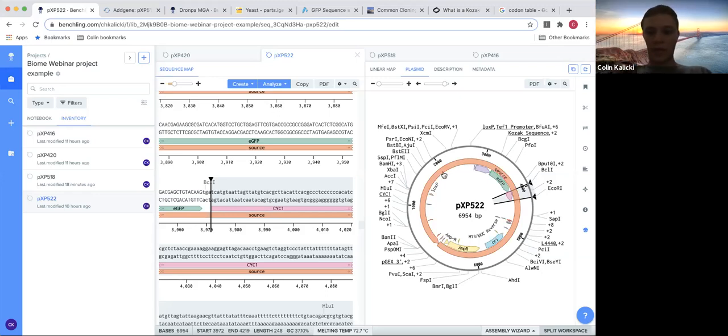And this plasmid design, if you see, it kind of goes both directions because it depends on which way you're reading it. You can really stack things on top of each other, and people who are really good at this can go crazy.